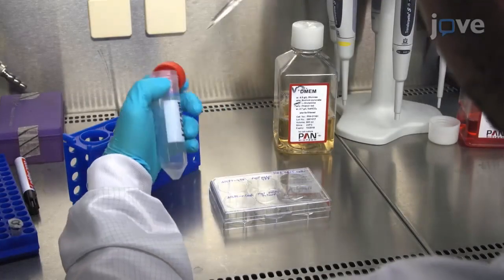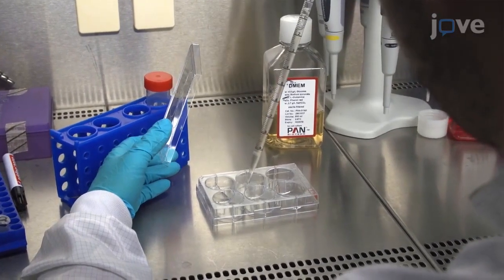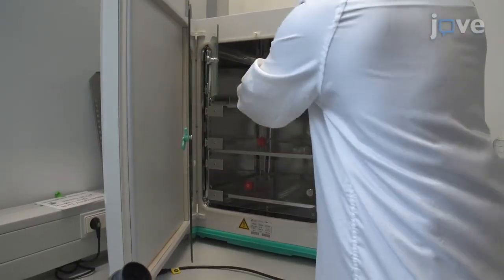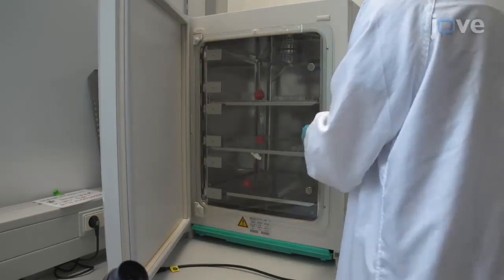First, seed an appropriate number of cells in at least 4 wells of a 6-well plate a day before transfection. Culture the cells at 37 degrees Celsius, 5% carbon dioxide, in DMEM medium, supplemented with 10% FBS and 1% L-glutamine.